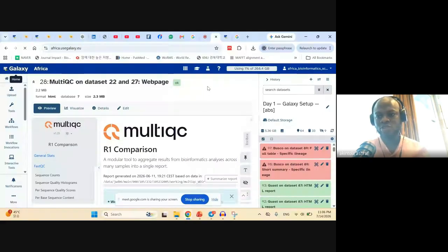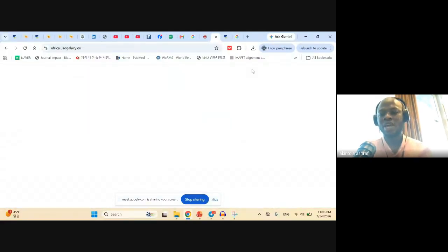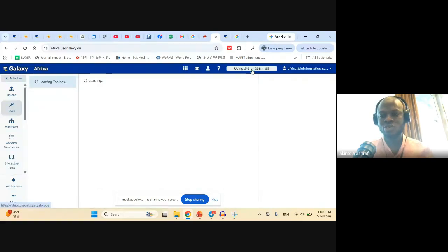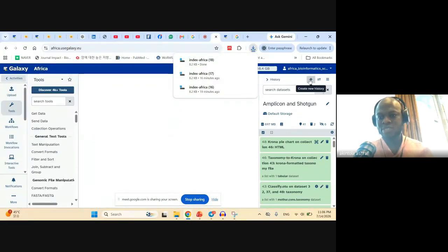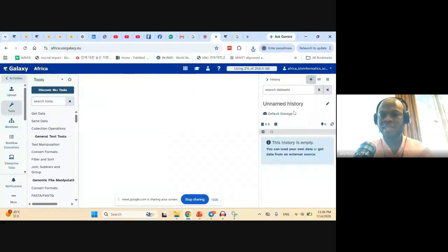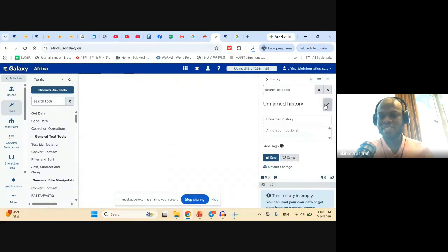So we are going to create a history. How do you create a history on your Galaxy? Come to this particular part and you will see this plus sign, which is create new history. You can click on create new history, and then come down here to edit the name of the history that you want to create.